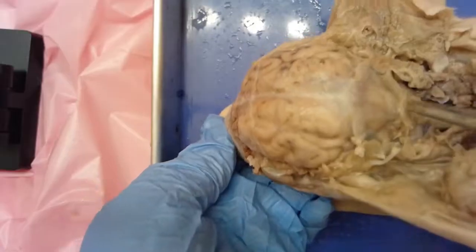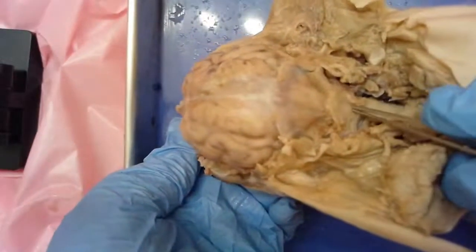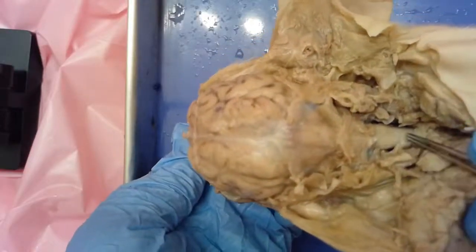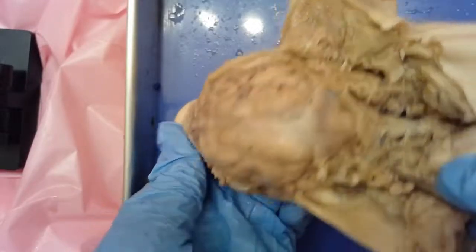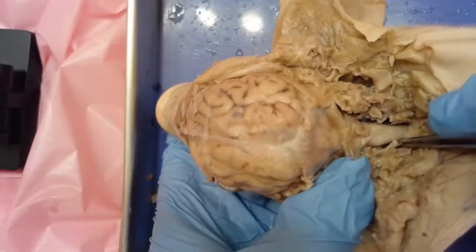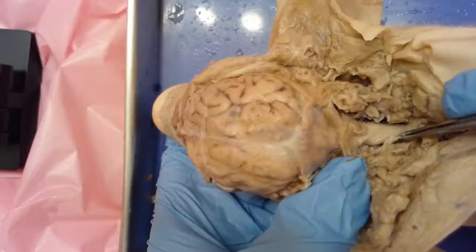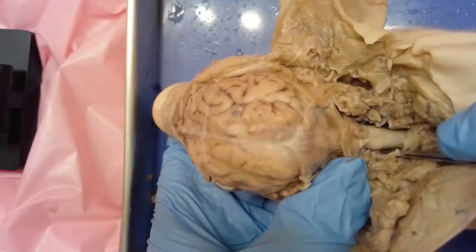The cerebellum runs all the way down into the medulla oblongata, which is going to eventually connect to the spinal cord. I've removed some of the vertebrae there so you can start to see the beginning of that. You can also see — let me lift up an area — that protective dura mater is also protecting the spinal cord as well as the vertebrae.